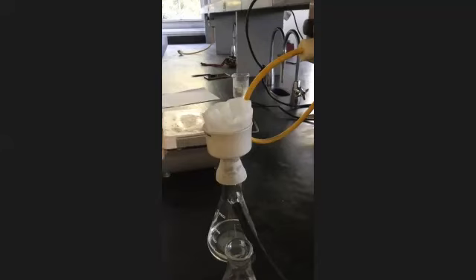So all we're calculating is the number of moles. So you need the density of the other two that we didn't use. Well, you need the density only of the liquid. Anything that's a solid, you won't have to have a density. So you can look at density, because I gave us the grams, so we should be able to get the moles.